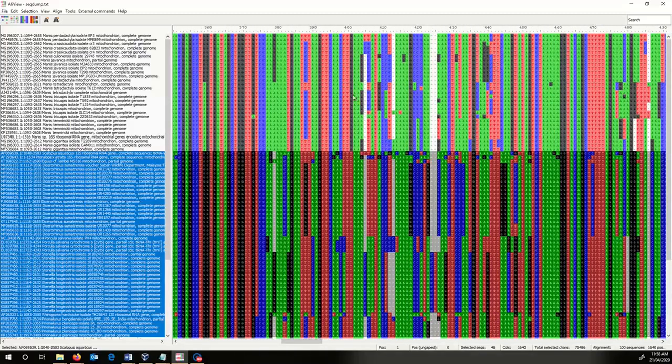This region here has a reasonable amount of information in it. You can see that it's sort of messed up. These two are from the same species, Manis pentadactyla, the top two are the same as you'd expect. Then there are 3 versions of crassicaudata here with some variation in them, but certainly consistently different from the pentadactyla.